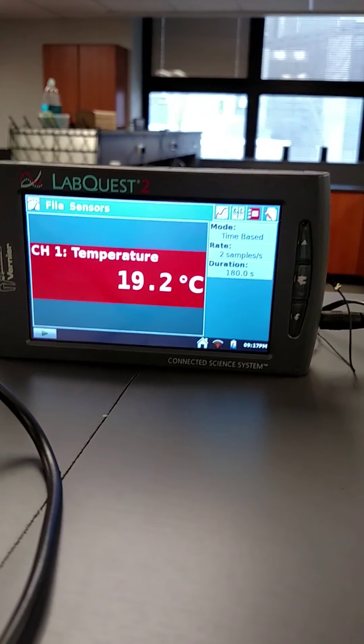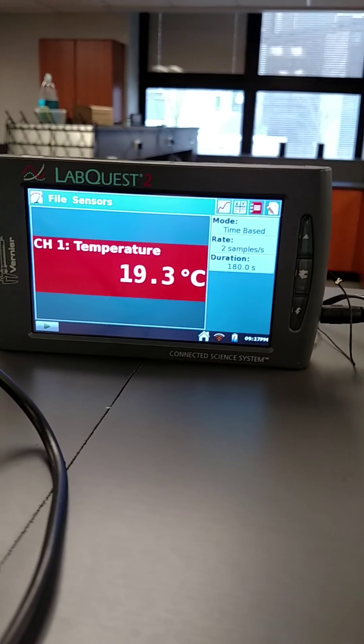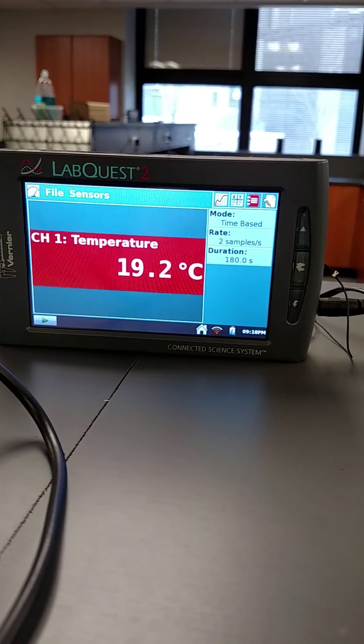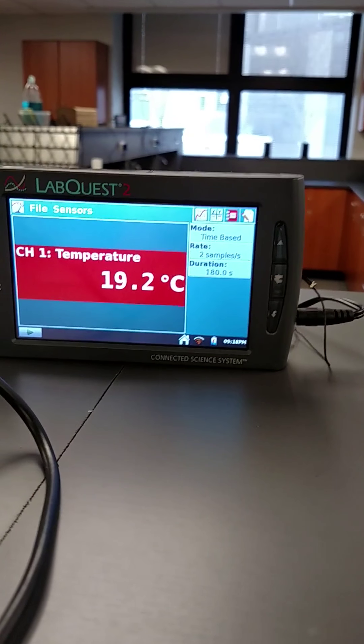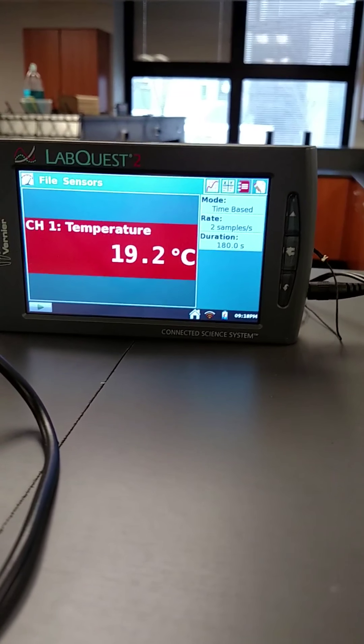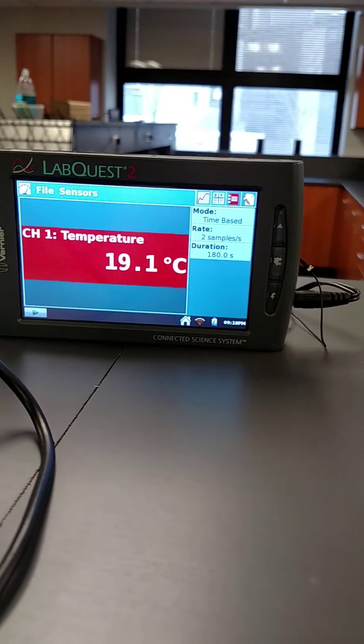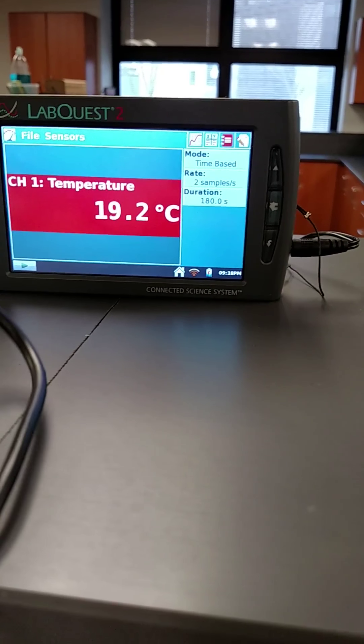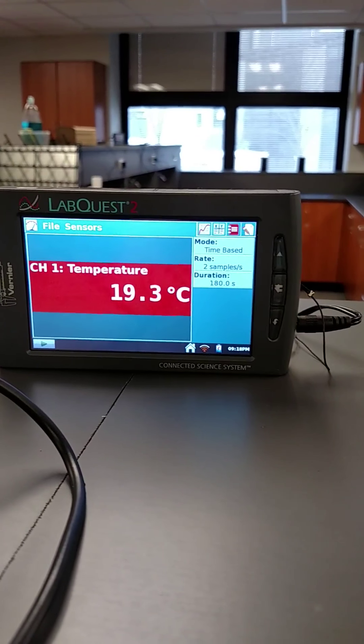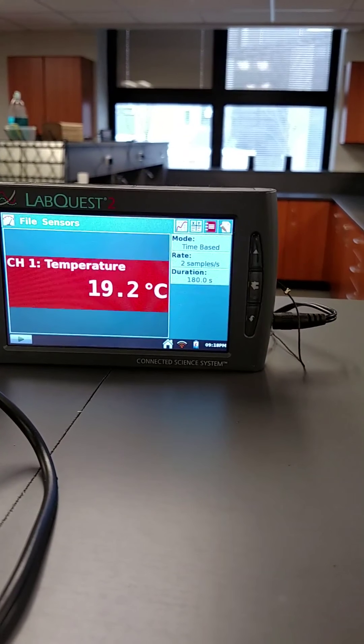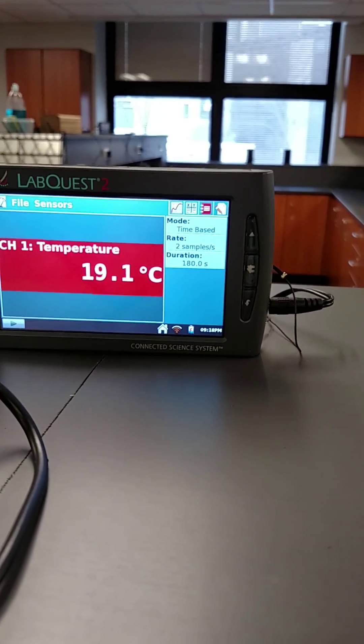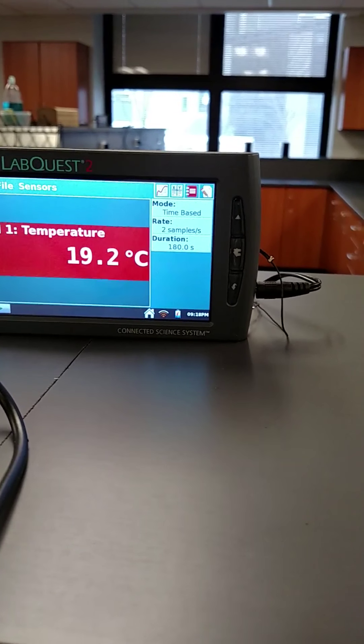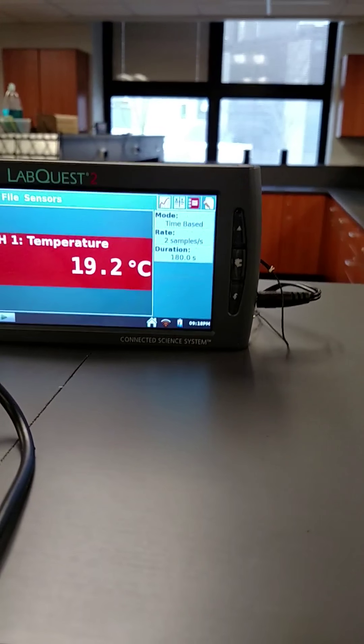This one looks like it's dropping again. Not by much, but it is going down. 19.2 is the lowest. Oh no, not yet, it's still going. Yeah, we're going to say it's 19.2. It's dropping, oh 19.1, but it's not quite staying there. We're going to call it 19.2.